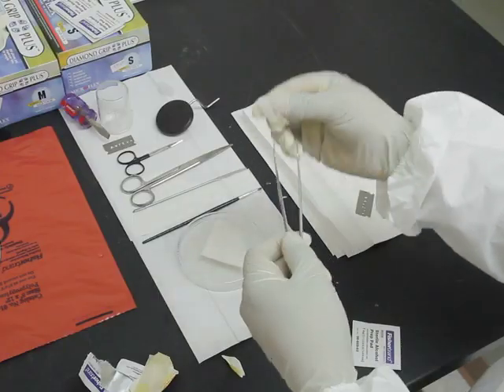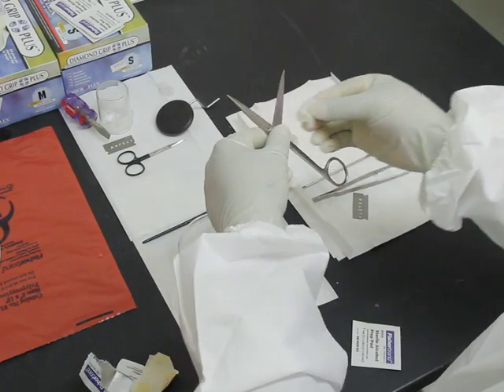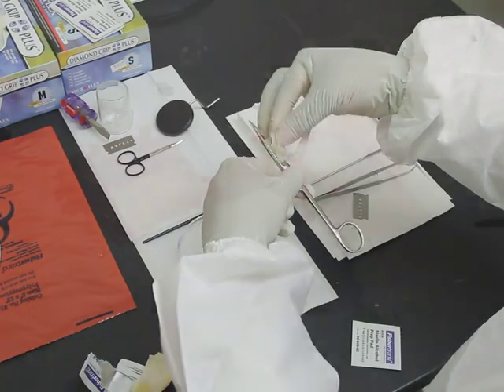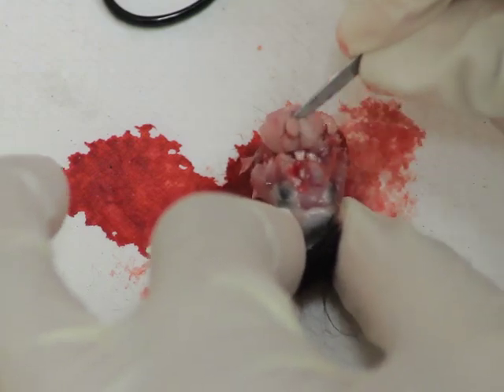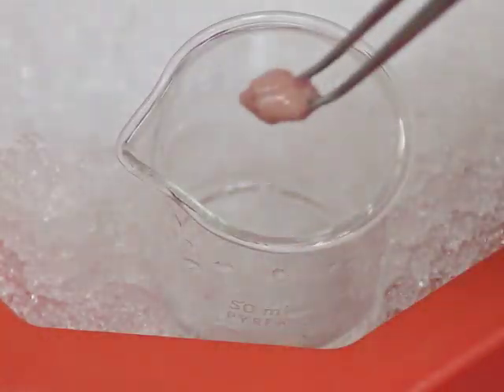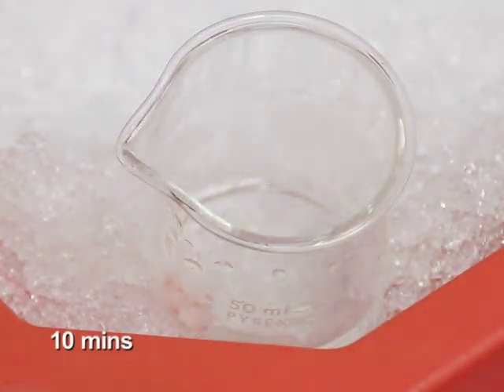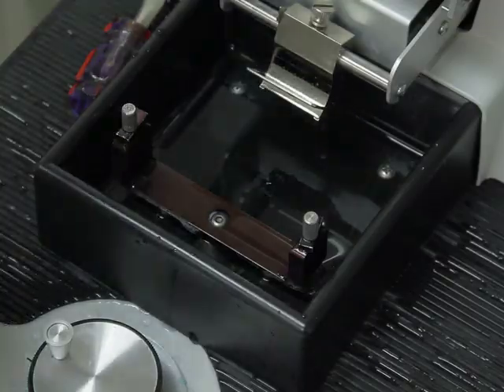Prepare a razor blade and the necessary tools required for dissection — such as forceps, spatula, and scissors — by wiping them with an alcohol pad. Then sacrifice a mouse by decapitation and quickly remove its brain. Place the brain in a beaker of ice-cold sucrose ACSF for approximately 10 minutes.